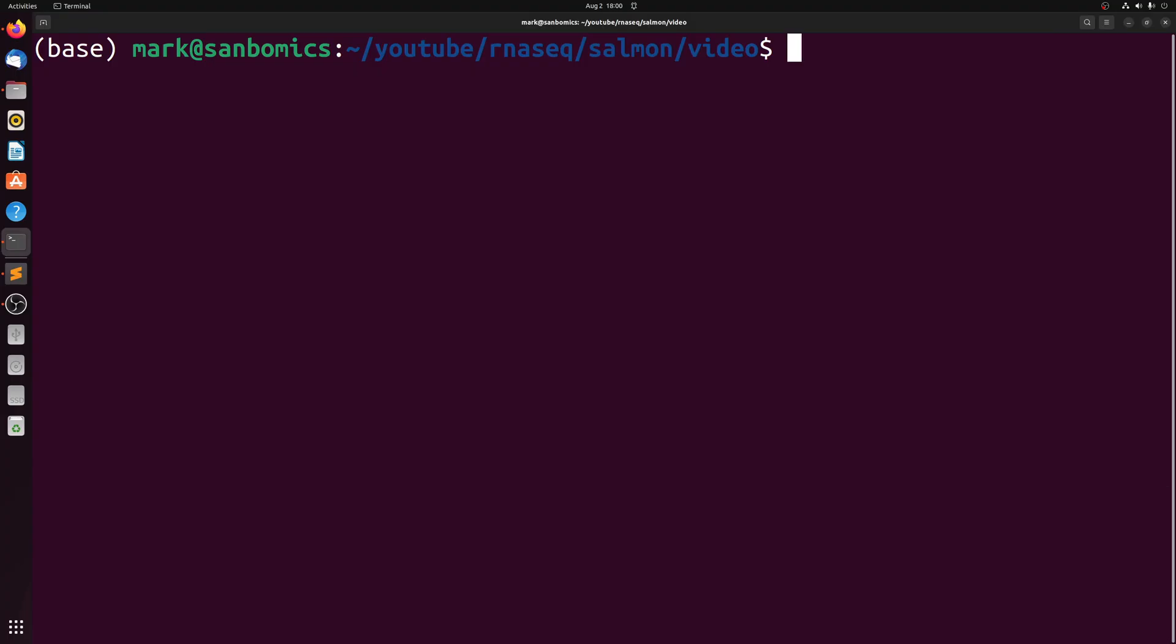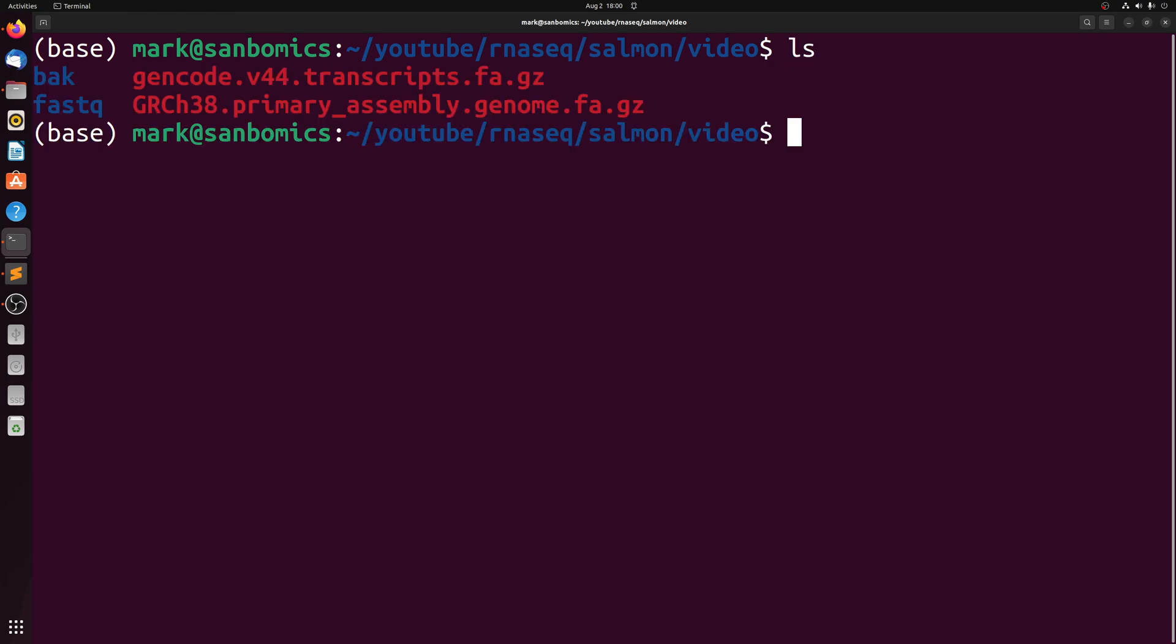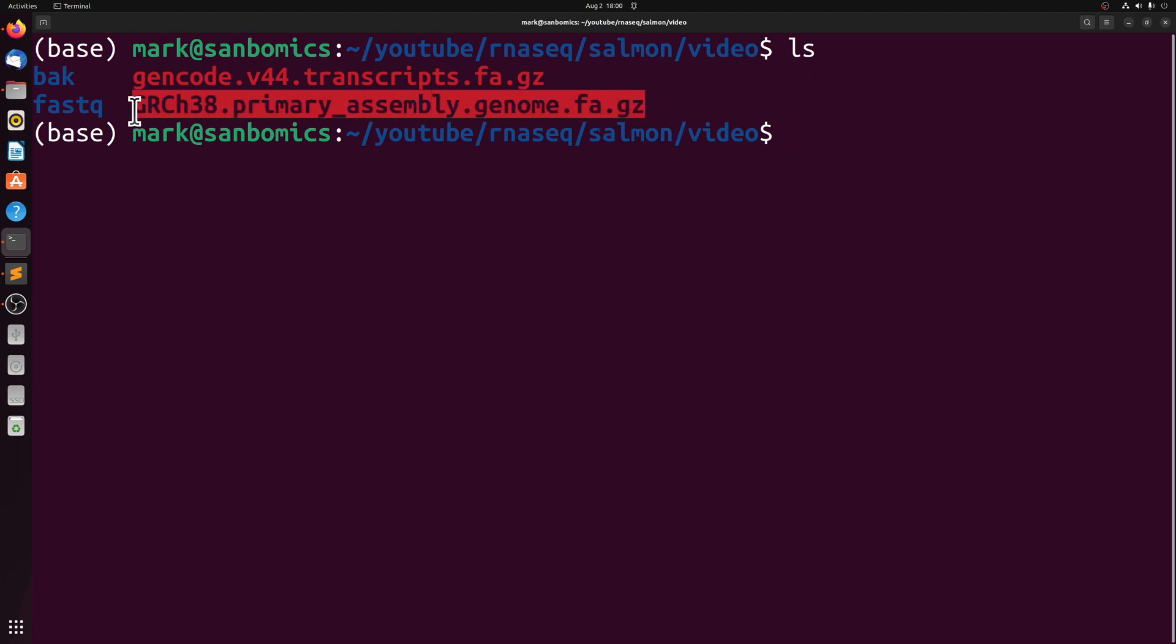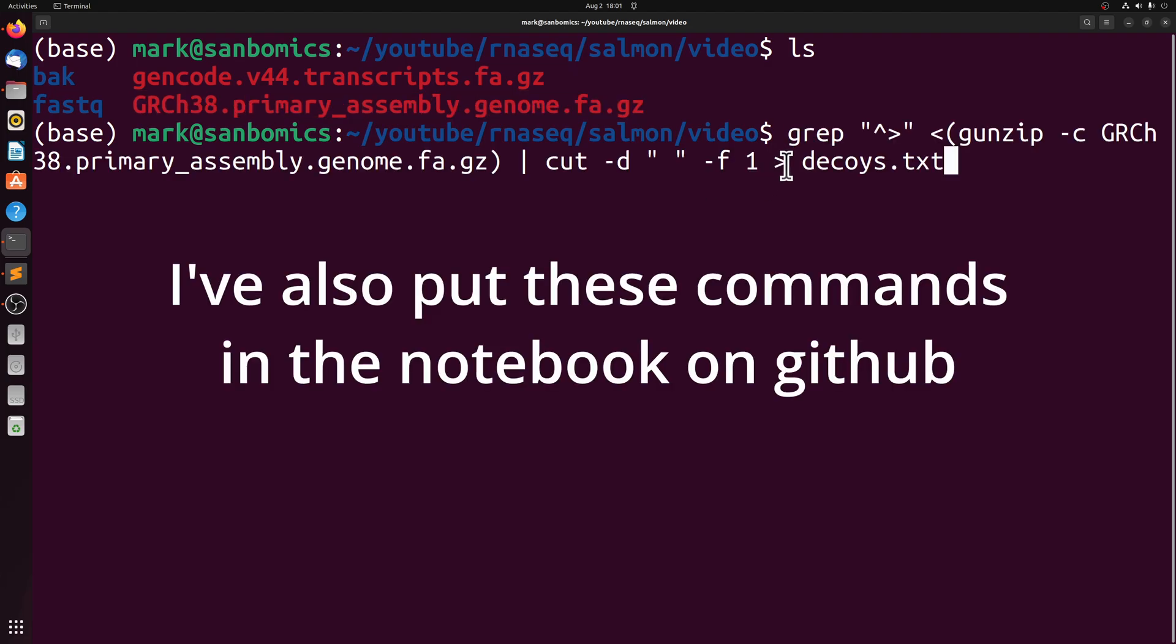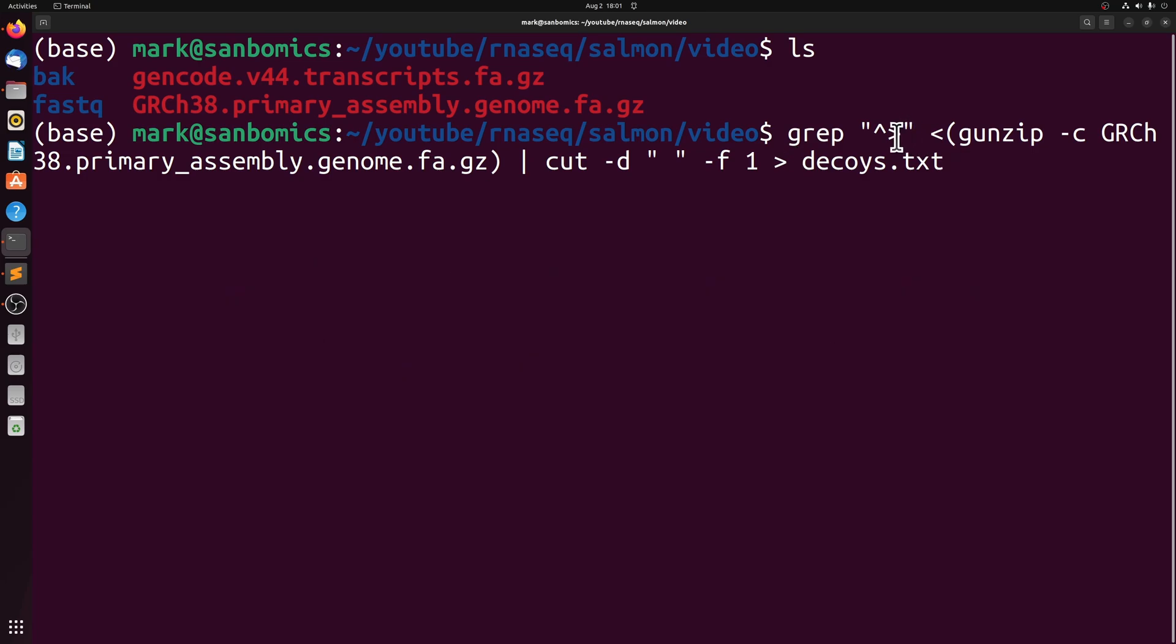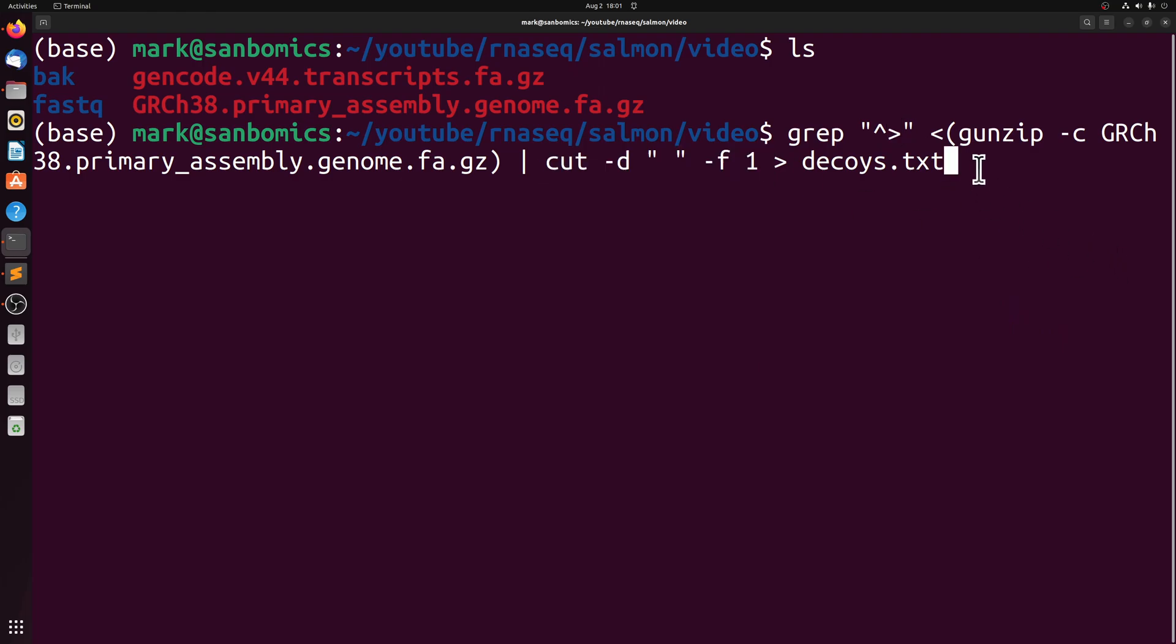So before we can start, we need to create a decoys text file that has the name of every sequence that we want to use as a decoy. And in this case, we're using the primary assembly as a decoy, so we need to get the chromosome names.